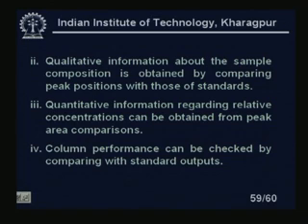Column performance can be checked by comparing with the standard outputs. Suppose I want to calibrate the column performance. I know the particular gas which we are injecting, so when an unknown gas is coming, I can calibrate how the column is working. The column efficiency can also be known by looking at the chromatograph. So these are the four features which we get from gas chromatography.